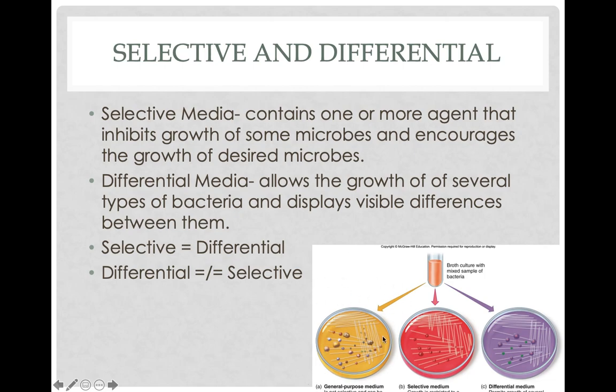They're not going to be able to tell apart different species. They're going to allow everything on there to grow. Pretty much everything that touches it will grow. Whereas a selective media, if you take a sample from your patient that's mixed together and you add it onto a general purpose media, you guys can see over here, everything in that sample is going to grow.